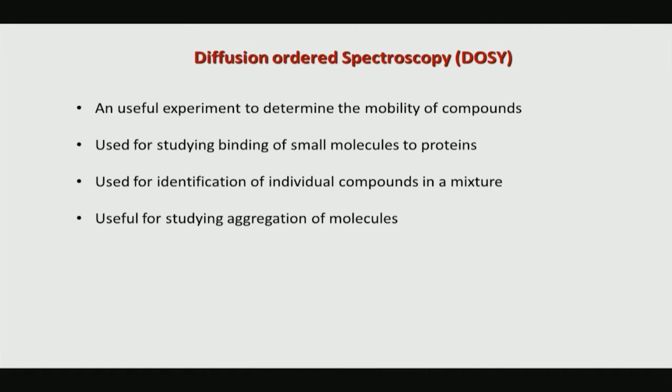So, by monitoring the diffusion coefficient at each stage of the process, I can figure out whether the molecule is in a monomeric state, or whether it is going to dimer or trimer and so on. So, aggregation processes can be monitored very nicely with DOSY. Now, let us see how the DOSY experiment works.